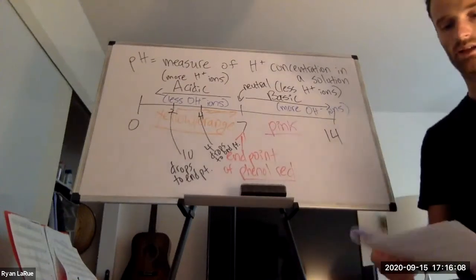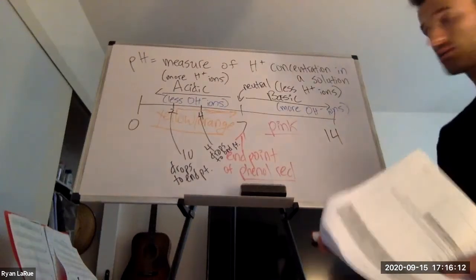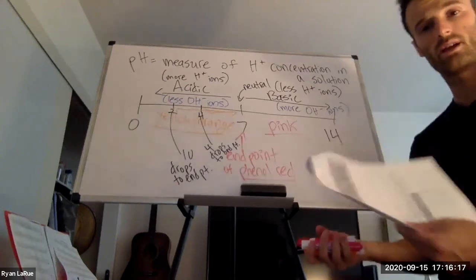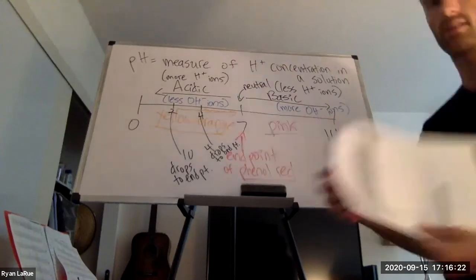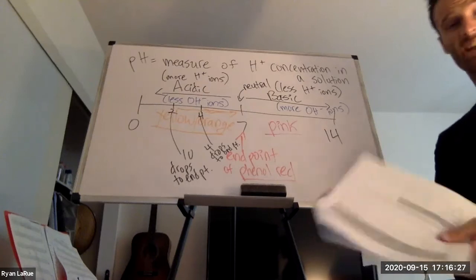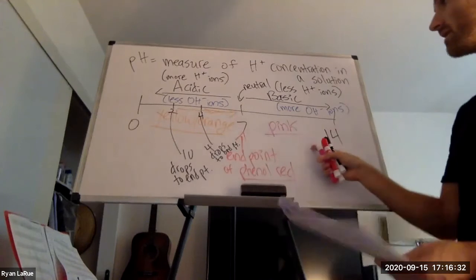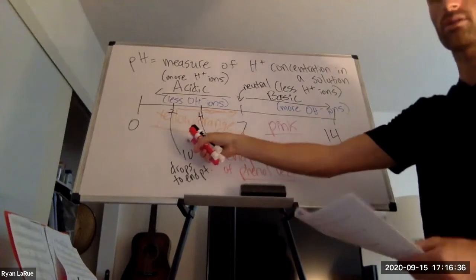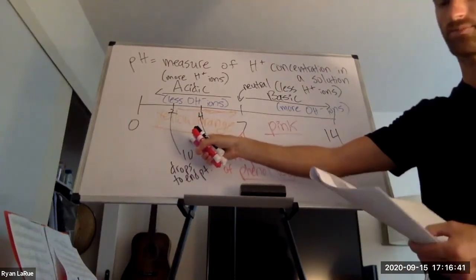So it's the body fluid, you add the phenol red, mix them together. You determine after that if it's pink or yellow to see if it's acidic or basic, and then that will tell you if you add acid or base to titrate it back to the endpoint. The titrant that you will use if you're basic, the acid, is HCl, hydrochloric acid. If it's acidic, you would use sodium hydroxide, which is a basic compound.